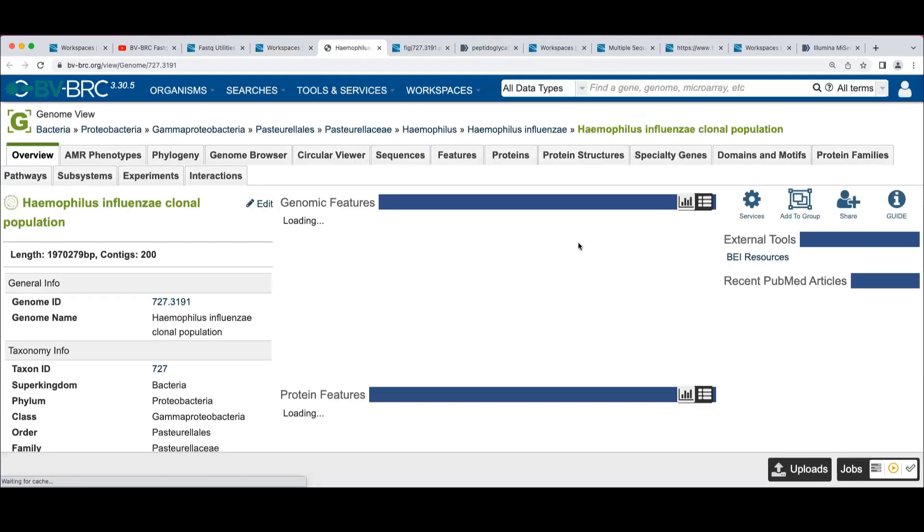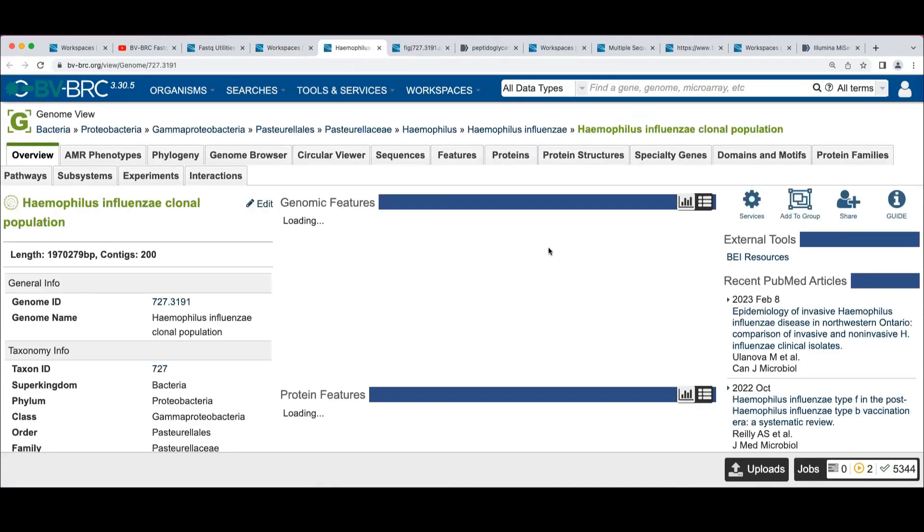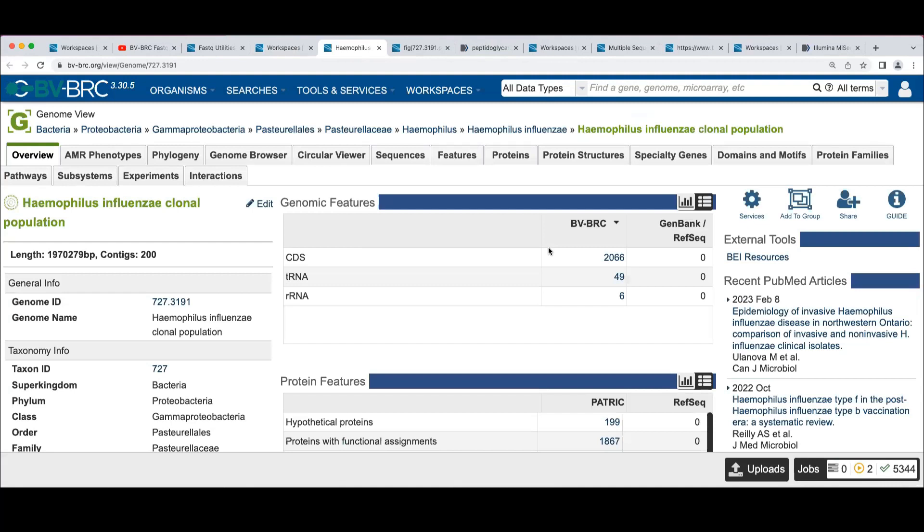And if you click on this, it will take you to the genome we mentioned, the virtual integration that when you annotate a genome in BVBRC, it gets added to the database as a private genome that you could use.